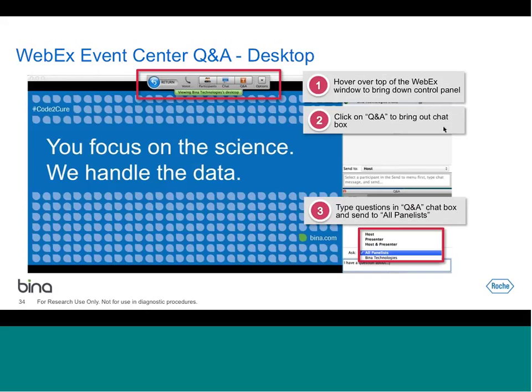Okay, we have a question. What kind of sample did you optimize your classifier to? Yeah, so the classifier is built based on the training data set. In our own experiment, we used Dream Challenge data sets. We also used in silico titration. So we have tested the classifier based on about 40, 50x whole genome sequencing. There's no reason that it will not work for targeted data sets or whole exome sequencing. But to do those, we need training data sets that have the appropriate coverage.